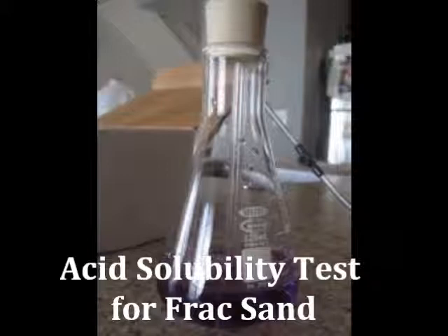Do you have frac sand? Possibly. Let's talk about one of the tests that you need to run on your sand to determine if it is high enough quality to be used for hydraulic fracturing. That test is the acid solubility test, and this is a test that figures out if you have undesirable contaminants in your sand. Some of those contaminants, examples would be carbonates, feldspars, iron oxides, or clays.